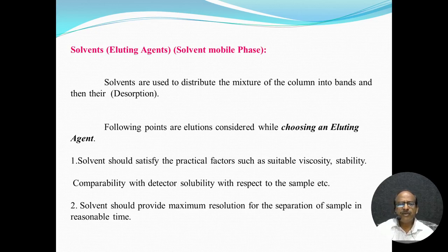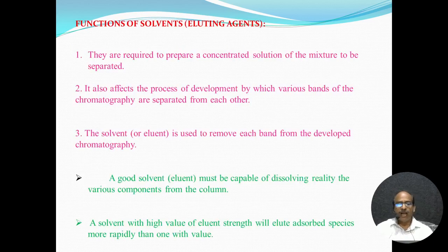What is meant by reasonable time? It should be not more than 5 minutes, not more than 10 minutes, not more than 15 minutes. Within 15 minutes, within 10 minutes, within 5 minutes, we have to complete the experiment, and then we get a good result. That is the most important thing for the solvent. Are there any functions of the eluting agents? Are there any functions of the solvents?